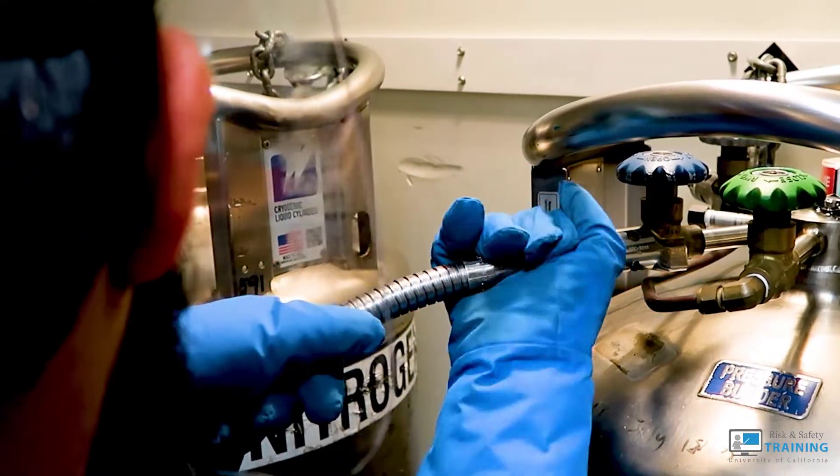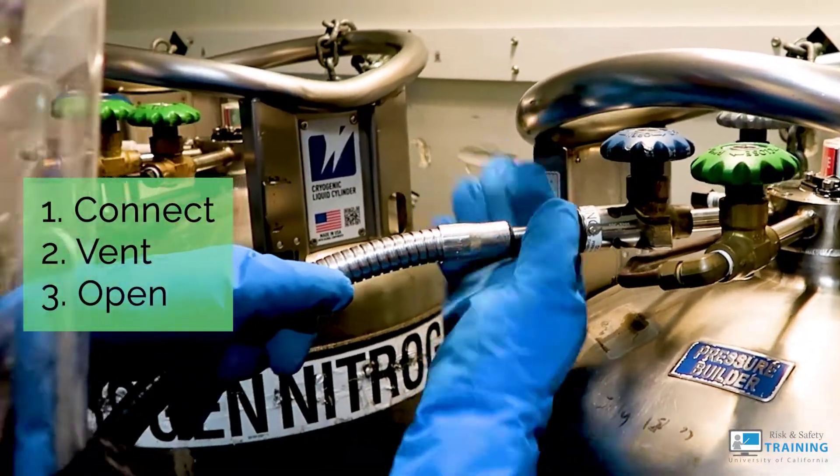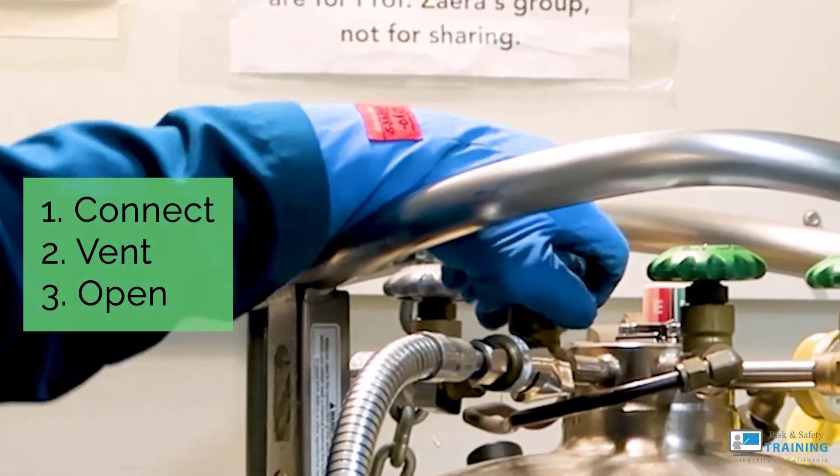When filling an open-mouthed cylinder with liquid nitrogen, the steps are generally to connect your source, ensure the vapors that build up during filling can vent out of your container, and open the valve until full.